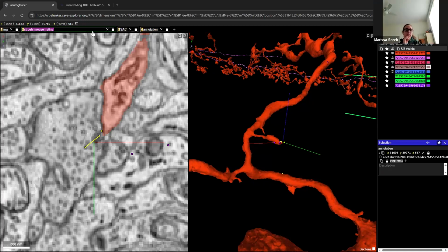And that can also be exported out. So we've had some folks who will send us lists of cells they've already identified, and then we'll update that into the database. And that's something we are working on, some tools so that people can add global annotations for typing cells. And as I think Yulia mentioned at the beginning of the call, right now we have a master spreadsheet for noting that this cell has been proofread or it's been typed, that kind of thing.